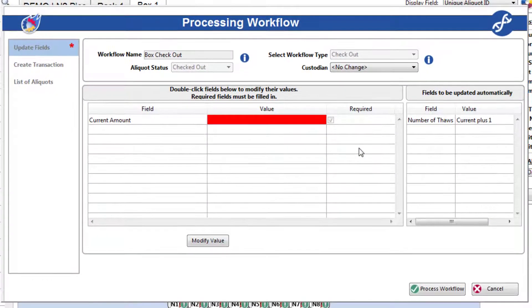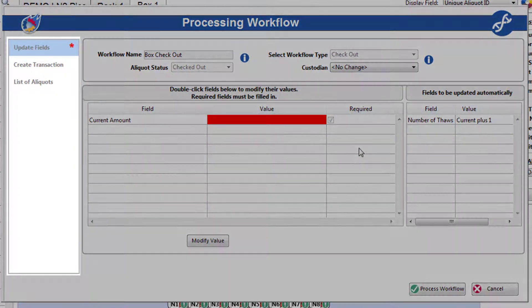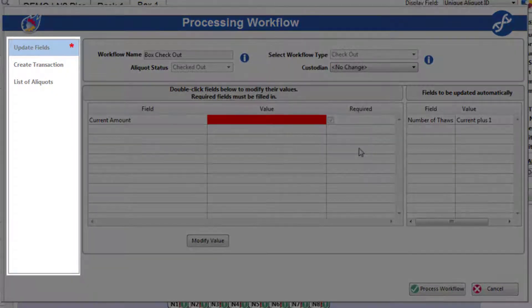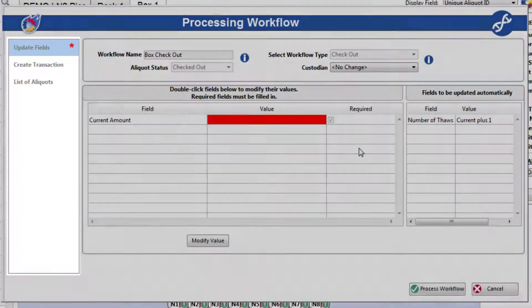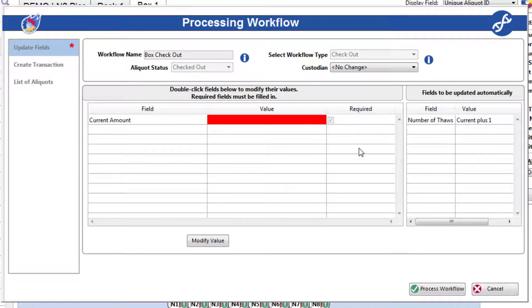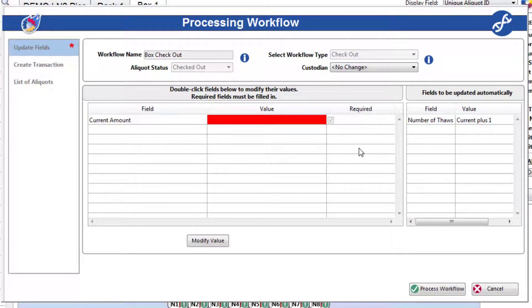The Process Workflow form will open. The left navigation pane will contain all of the actions configured as modifiable during processing, and pages with a red asterisk are required to process the workflow. Some actions have been configured to run automatically, such as removing these aliquots from the freezer, and will not appear in the navigation pane.